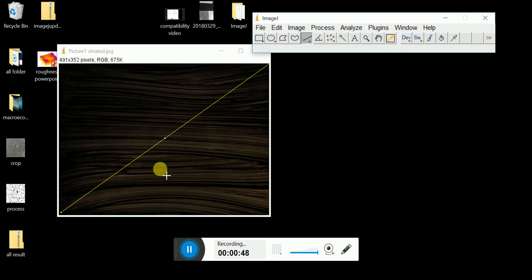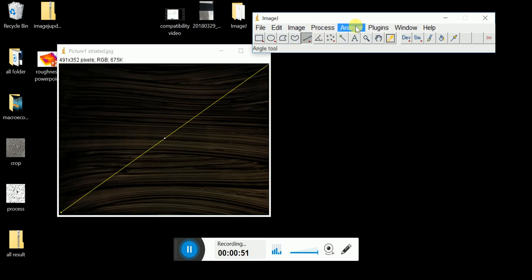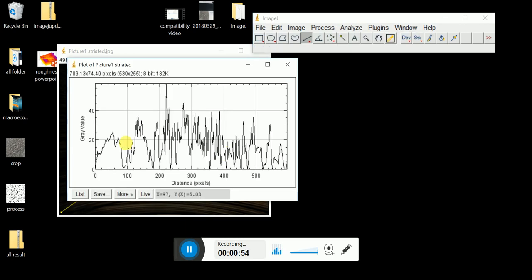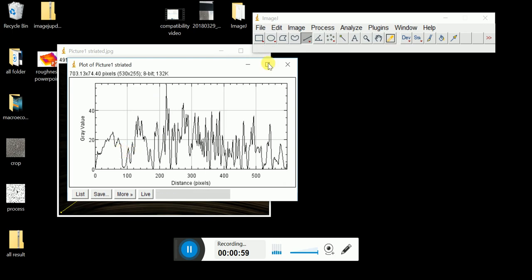You can see that it turned black, it's normal. So what you need to do is analyze again. You can see now it's a straight line. So this is how roughness test works - it calculates the mean, it compares all the peak with the mean, so the straight line in the middle.